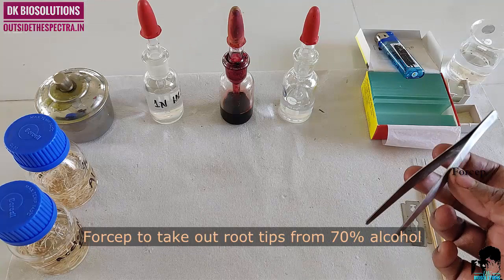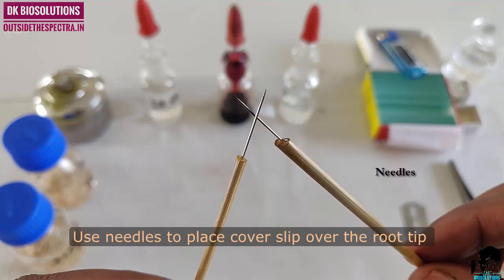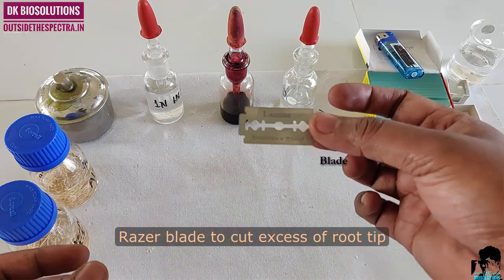Forceps to take out roots from alcohol. Needles to place the cover slip over the tip. These are lab-made needles using broomsticks, stitching needles, and DPRs.